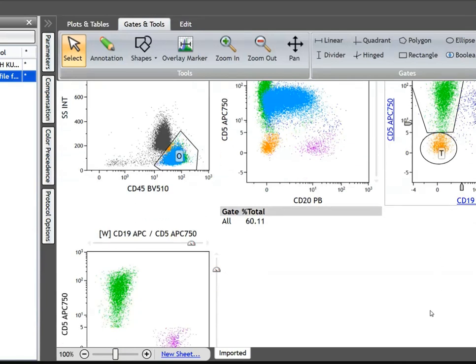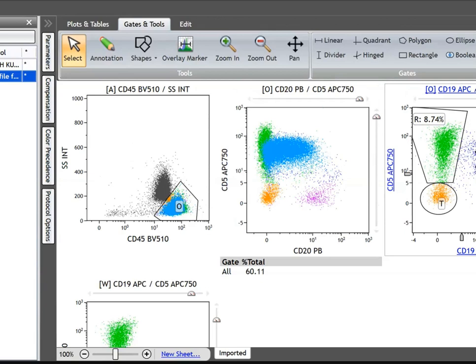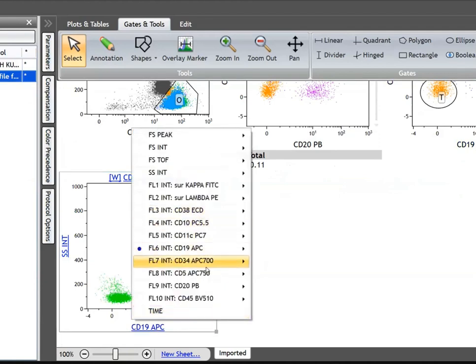Now I want to check how is the CD5 intensity in the neoplastic cells. This is the case of CLL. You know CLL is CD5 positive, CD23 positive. Even mantle is CD5 positive, but it is CD23 negative. This is the CLL case which I'm using to show the demo. So I want to check how is the intensity of CD5 in the neoplastic cells. If you are experienced, you can directly call it by here. But since you are beginners, I'll put the internal and the negative control.